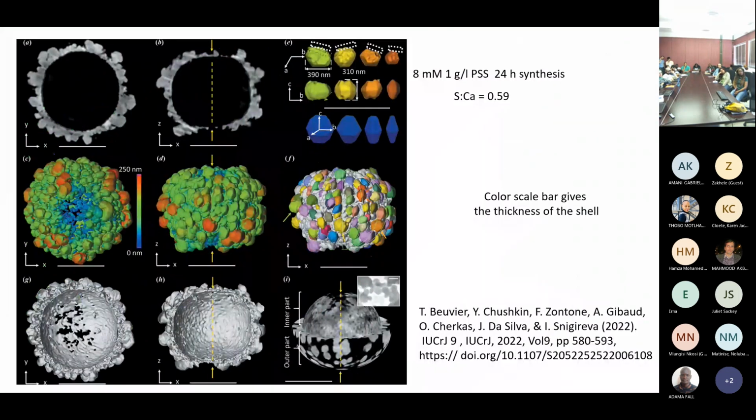Okay. And so we were trying to understand what was going on. And typically, what we found out is that all those little crystals which are formed at the surface, the lateral crystals, tend to align along the meridian of the particles. Why is that? Mainly because those particles are polar. And because they are polar, the dipole moments try to align parallel to each other.